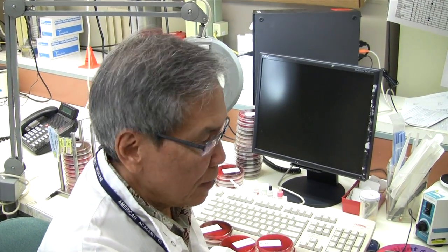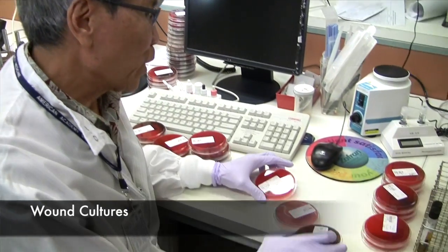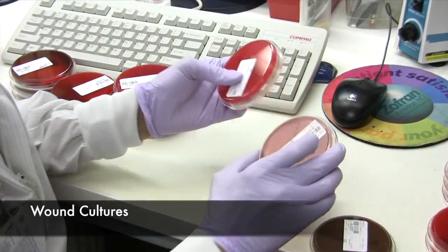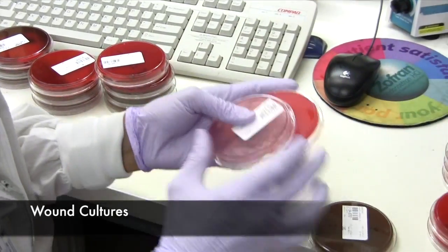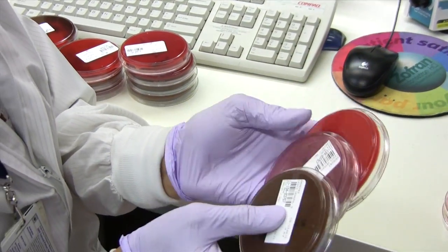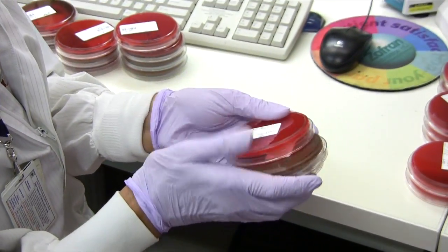Now we talk about the wound culture. For the wound culture, we're using three different types of media for ease of identifying the organism.